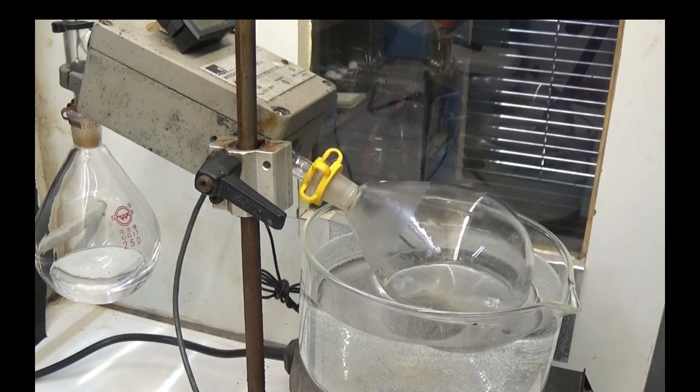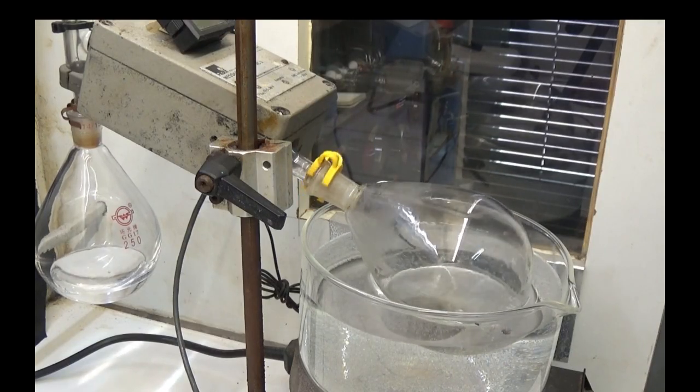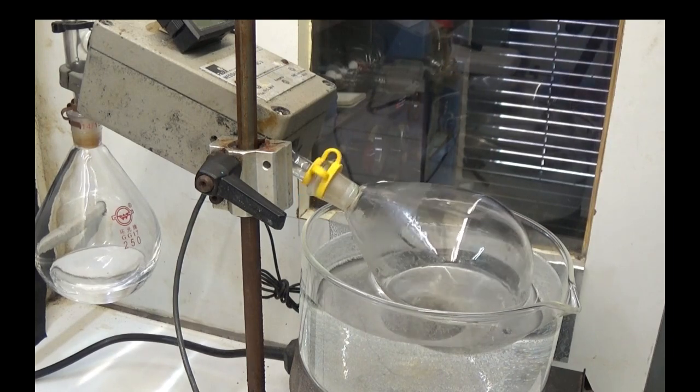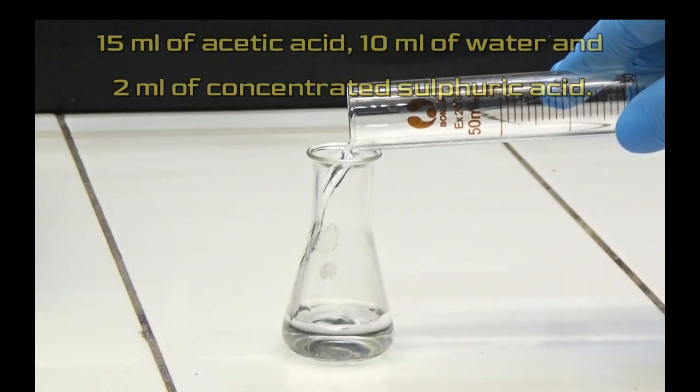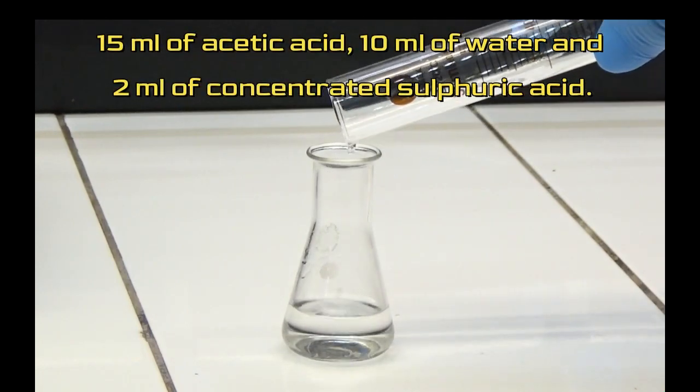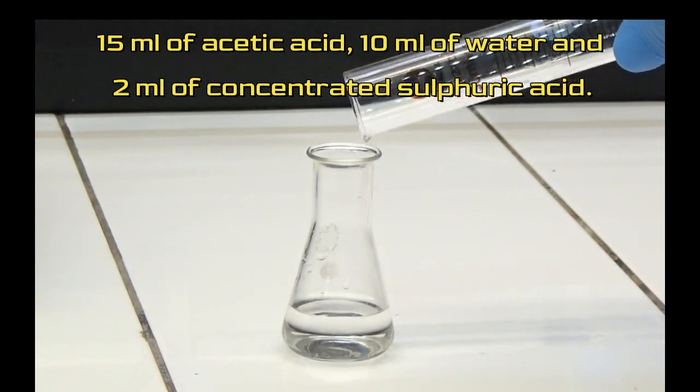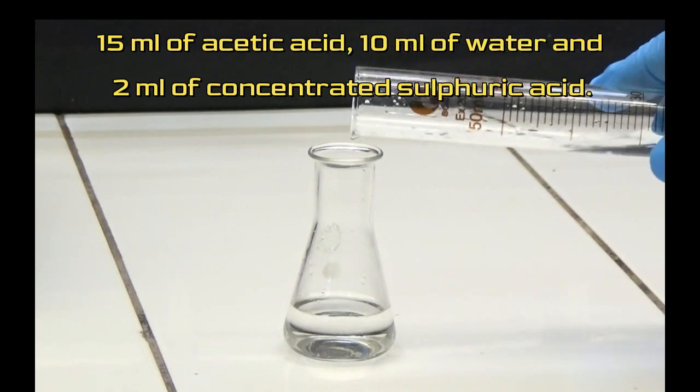Combine the layers of ether and evaporate without drying. Make a solution using 15 milliliters of acetic acid, 10 milliliters of water and 2 milliliters of concentrated sulfuric acid.